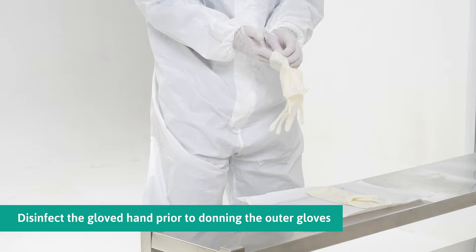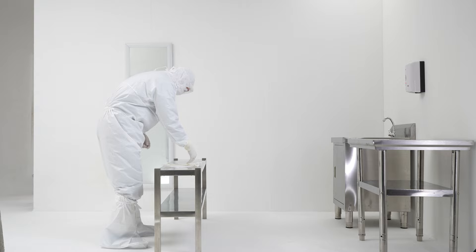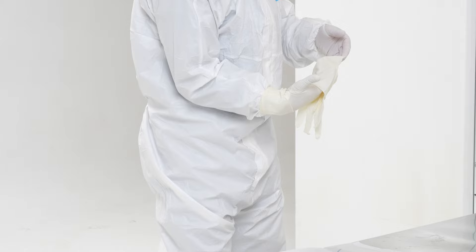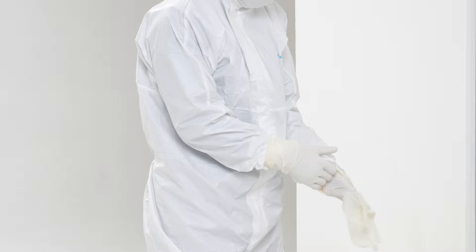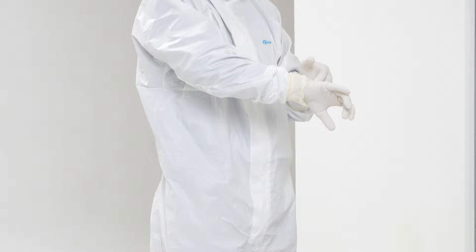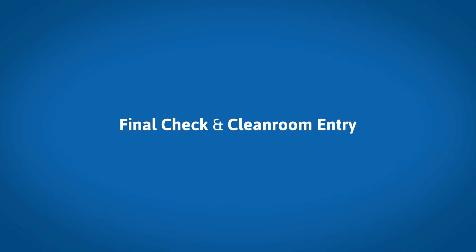Grip firmly at the folded cuff and slide the other gloved hand into the outer glove. Pull the folded cuff towards the wrist. Slip the fingers of the sterile hand into the pocket formed by the folded cuff, slide the other gloved hand into the sterile gloves, and unfold the cuff over the sleeve. Use the sterile hand to unfold the cuff of the first sterile glove until it overlaps the sleeve.